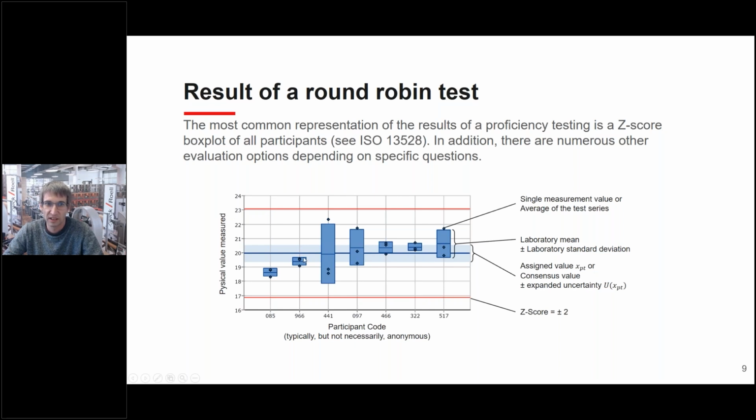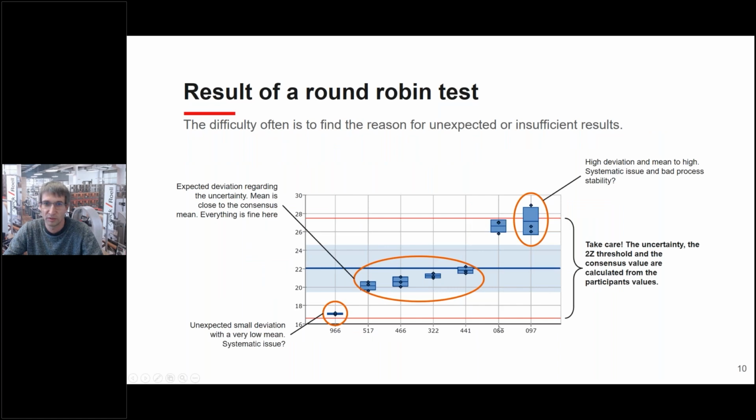And then finally, the small boxes here are the participants, the single labs in this case. Every lab did a test 3 times, repeated 3 times, and this is the average of the lab and the deviation of the lab. And then you see here, this lab in average is somewhat nice, but the deviation is a little high, and there are others where the deviation is a little bit closer.